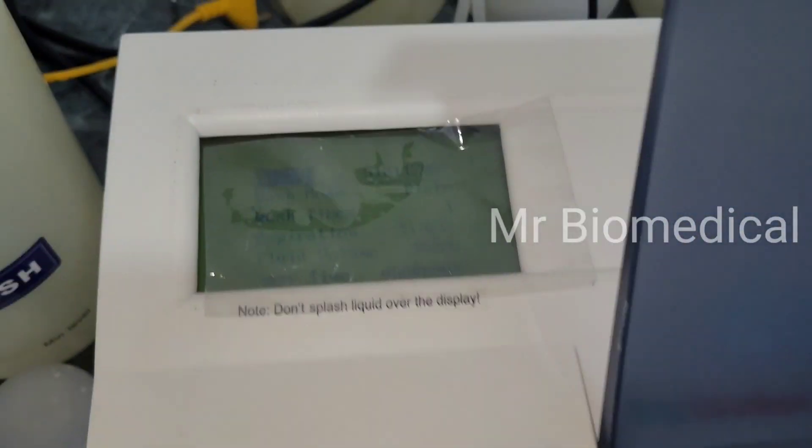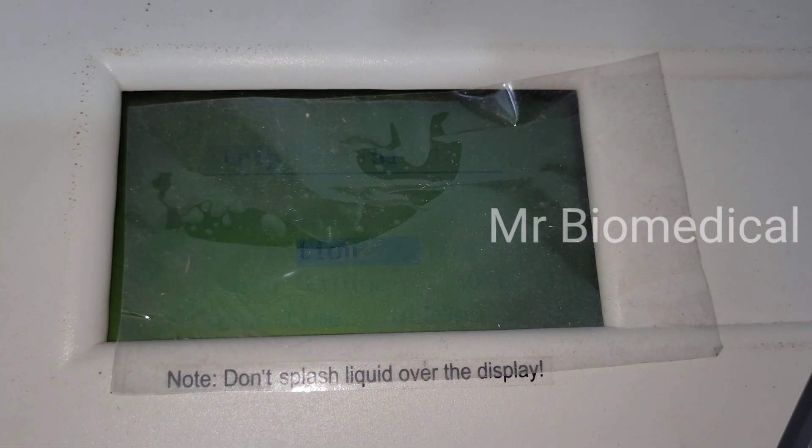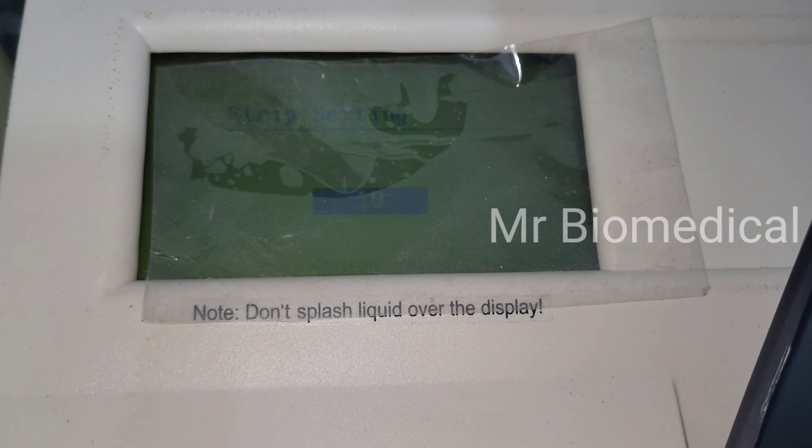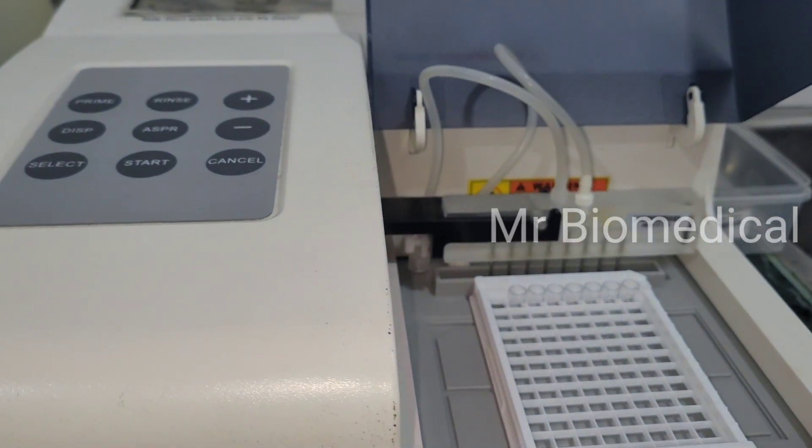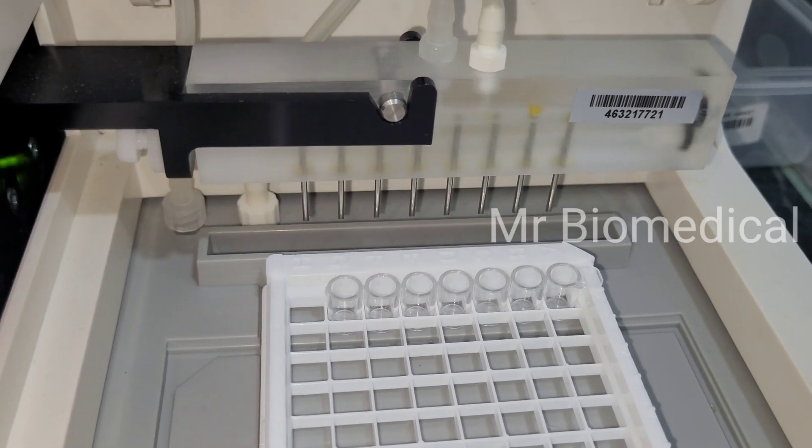Now let's start with a wash. Just press the start button and this is a strip count and we have only one row of cuvettes.